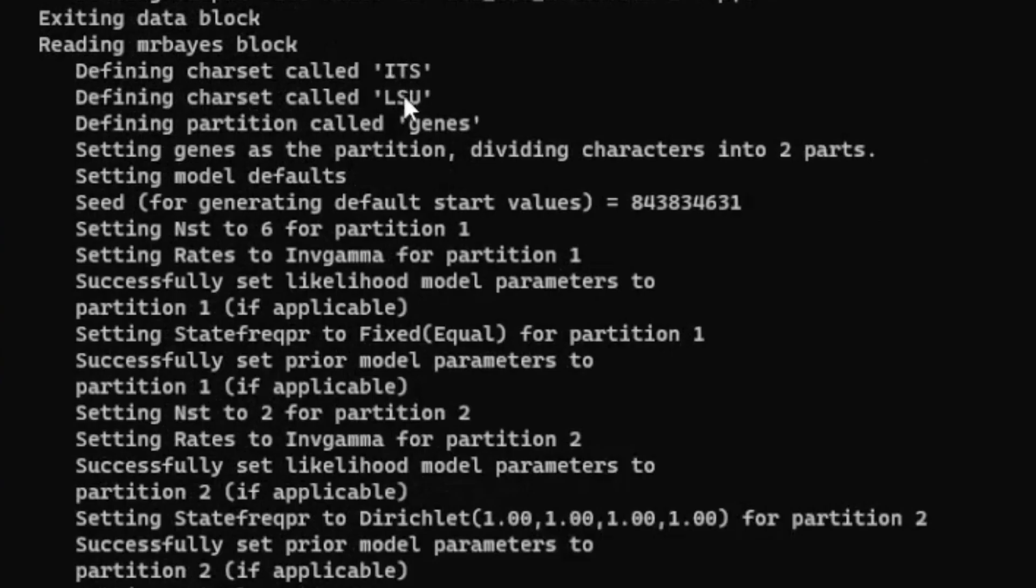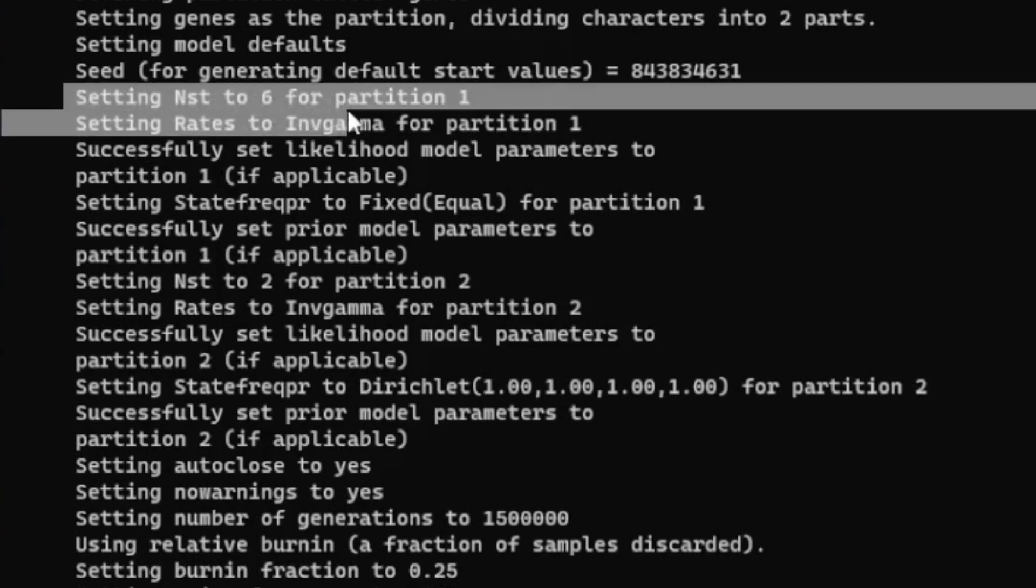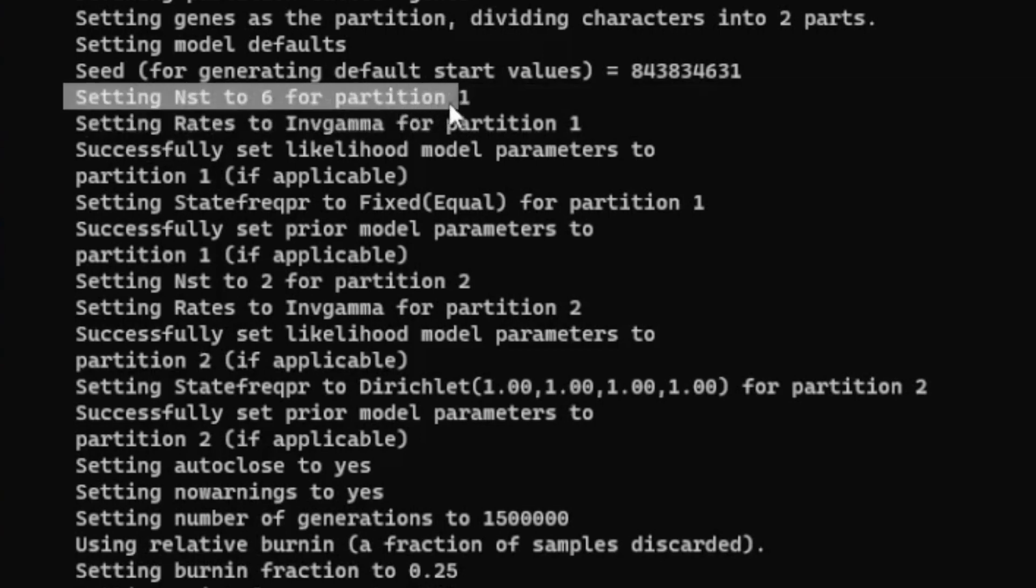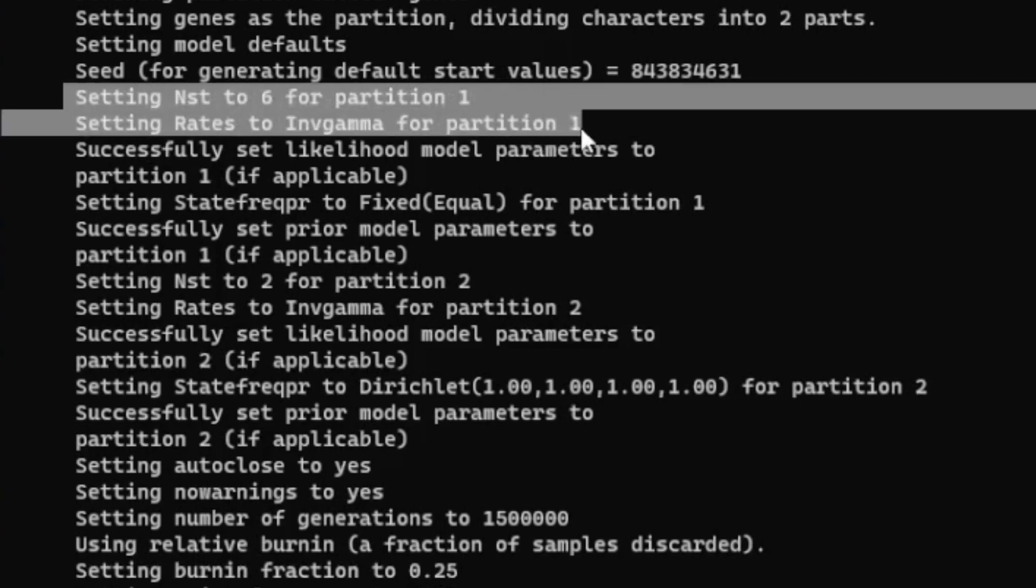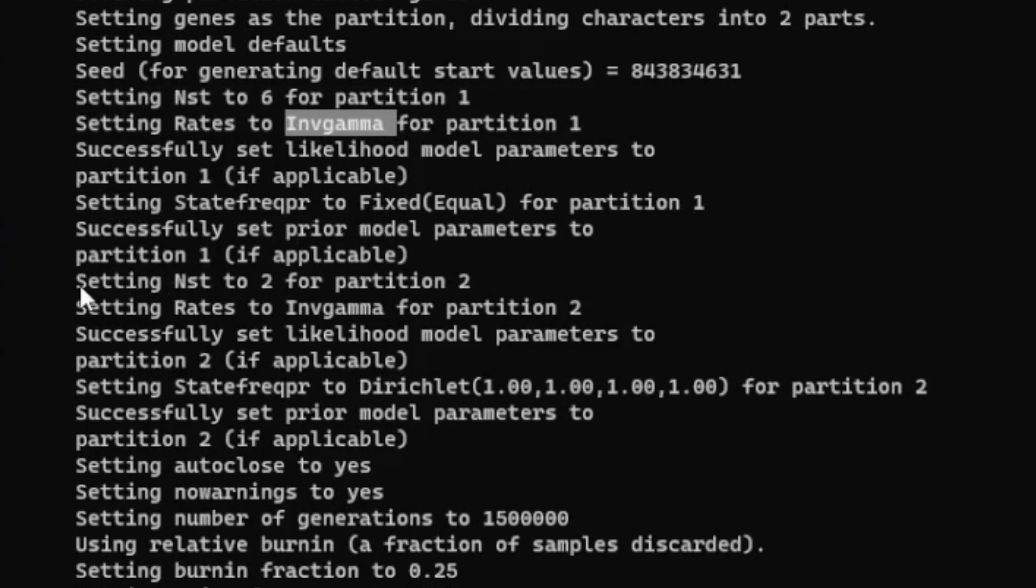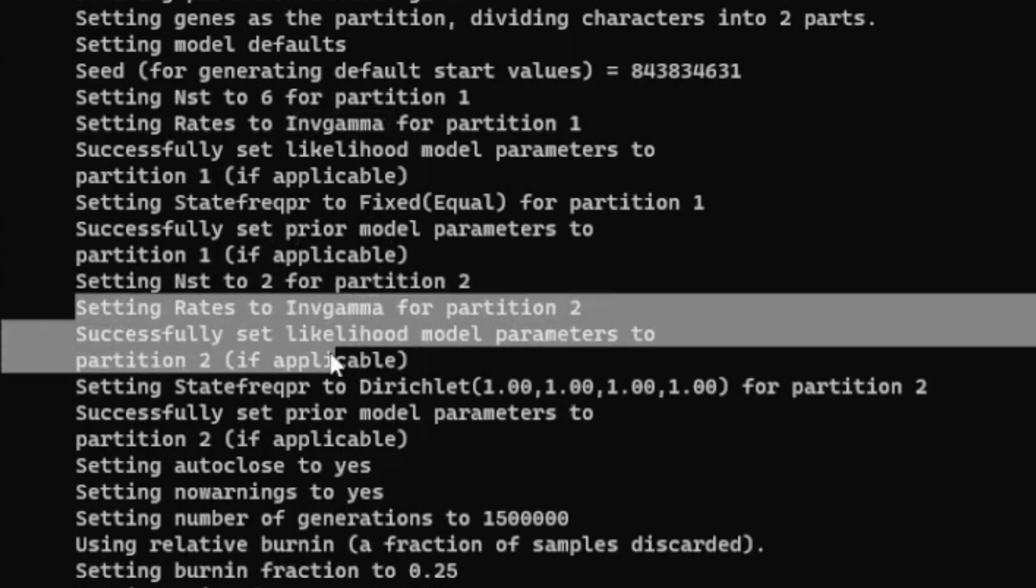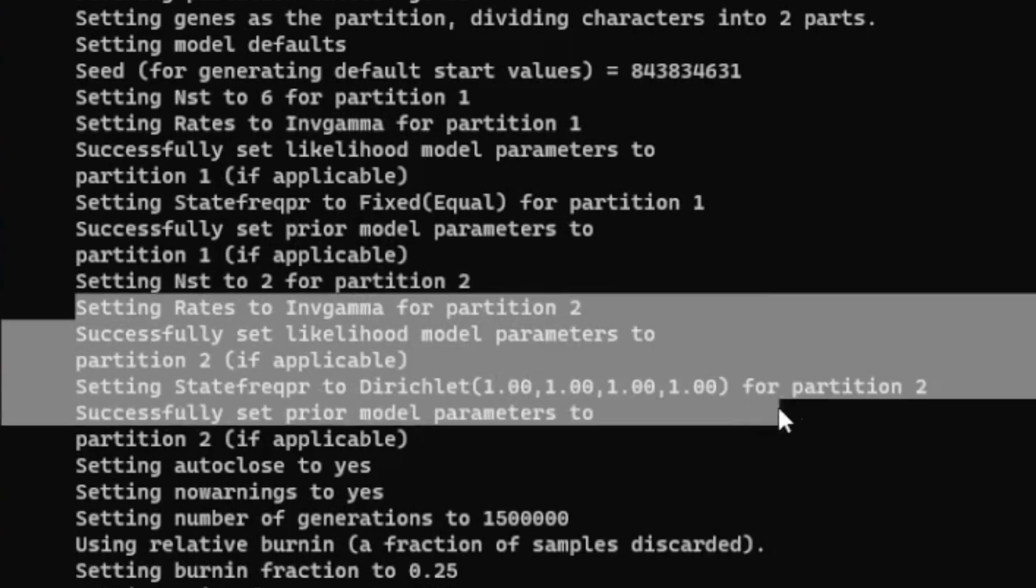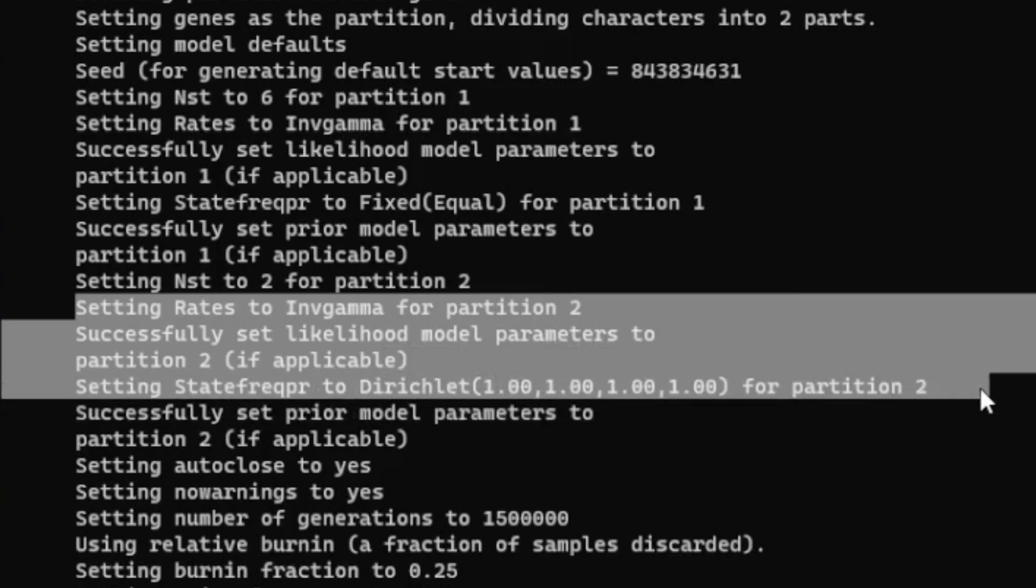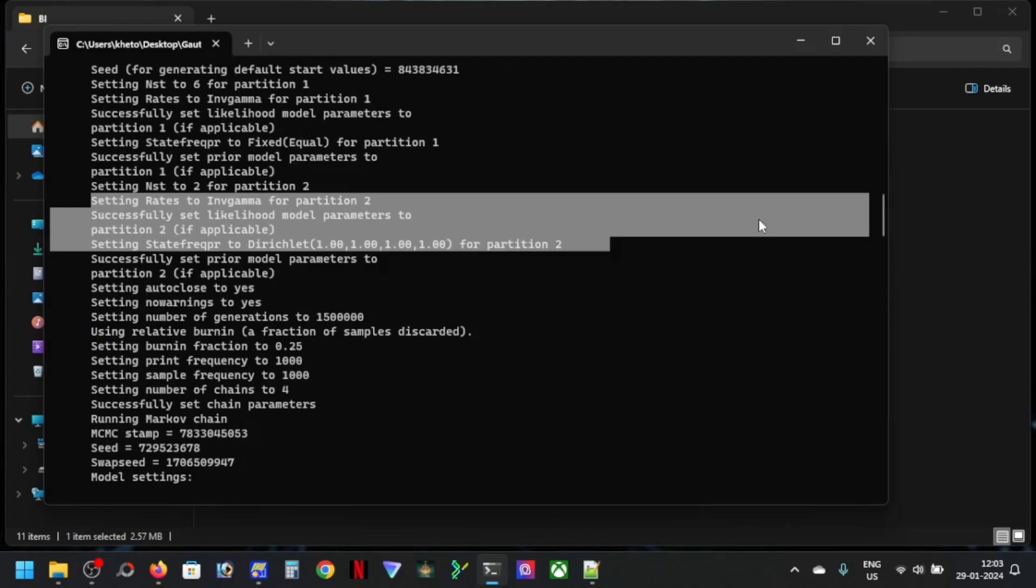So I can show you now that it is selected two different models for the defining characters, ITS and LSU. So now setting NSD 6 for partition one, that is SYM+IG, this is invariable sites and gamma. It's already done the state frequency all this, and setting NSD 2 for partition two. From here you can see this is for your second partition.